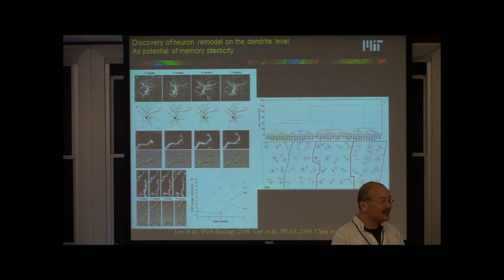If you want to see muscles, for example, you can actually see muscle structure very well based on so-called second harmonic generation. I kind of thought, I put it in the title, but I always, as I say, too optimistic, can't really go through that much.